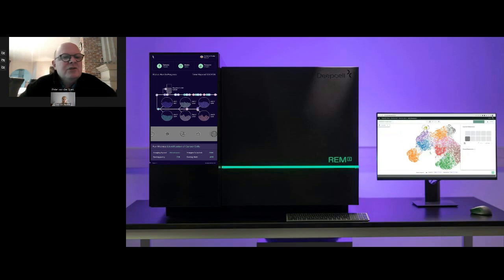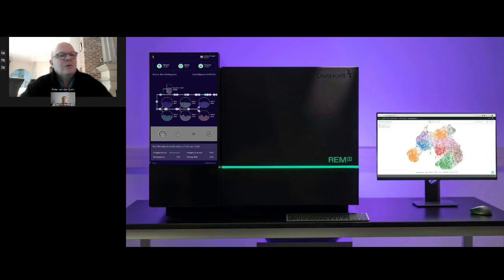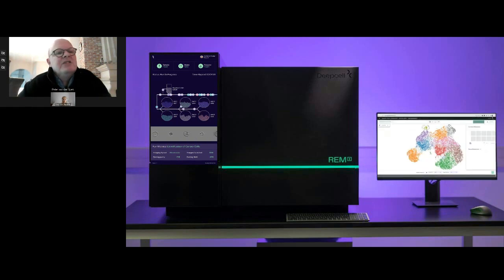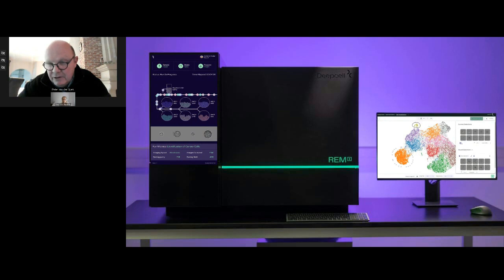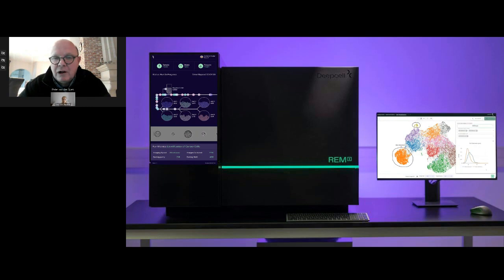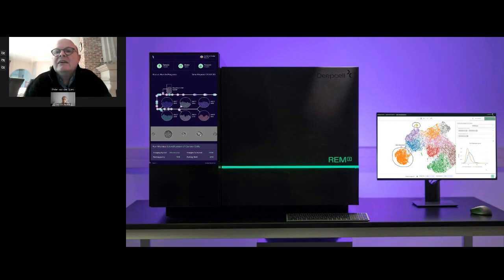Here you see the machine in action. You see cells going through the machine. The cells can get sorted and are captured in 6 different wells, and the remaining cells stay in the waste bucket that you see on top of the queue where the cells are passing by. On the right-hand side, you see the different clusters. Each dot represents a photo of a single cell, and in each cluster, cells that have the same morphology upon interpretation by the AI model are grouped together in these UMAPs.